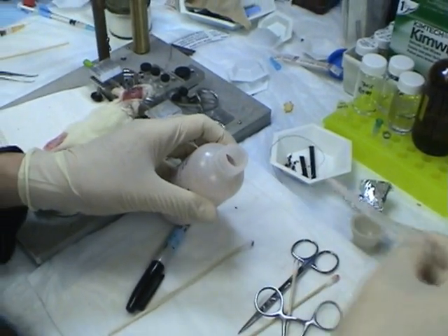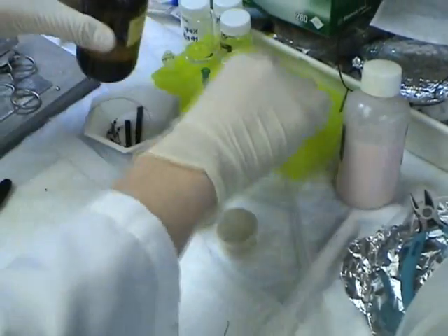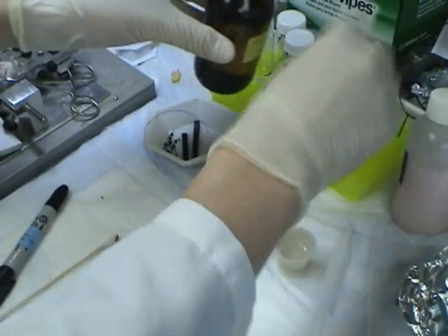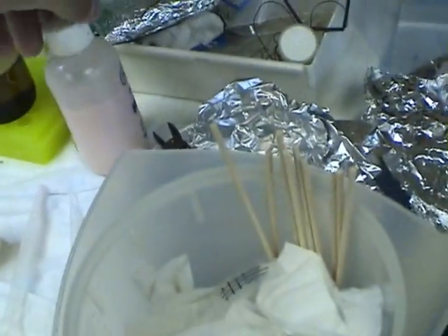It's dental cement, right? Yeah. The smell is so bad, but... Is this part of the cement? The whole compound? After mixing both things, we start to apply it.